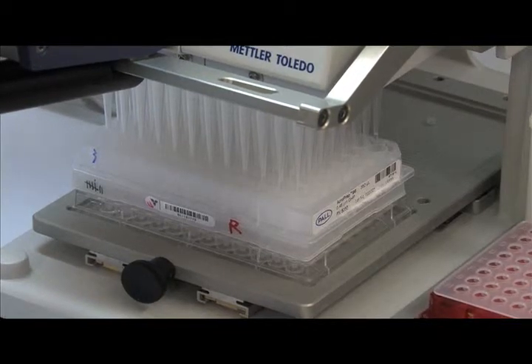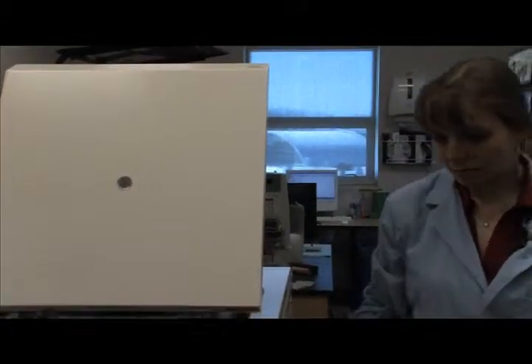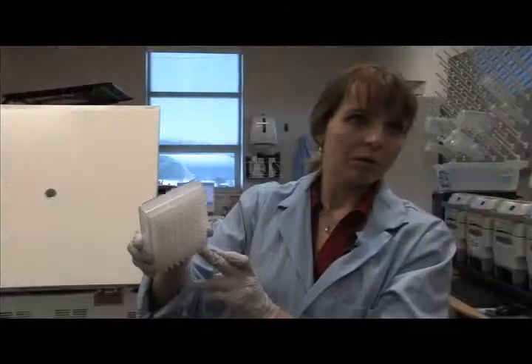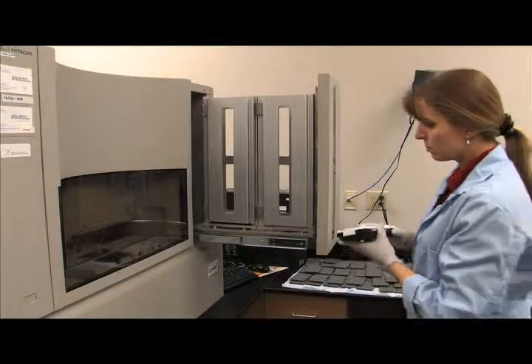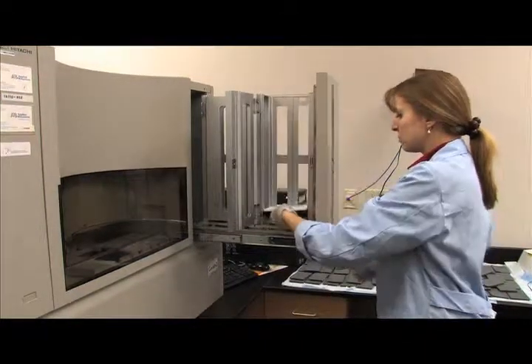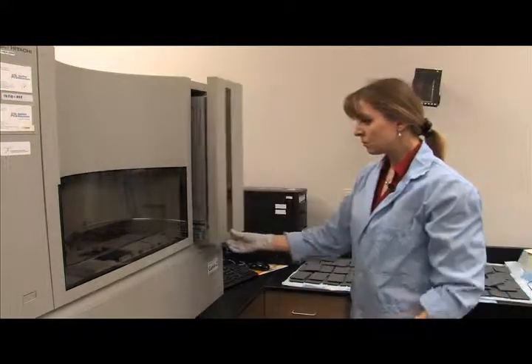No blowout is required. Plates are spun at 750 G's for three minutes. Clean sample is collected into a plate containing 25 microliters of diluted EDTA. This is one of the final stages of acquisition DNA barcode. The plate is sealed with SEPTA and assembled into a sequence assembly plate. The plate is then loaded into the sequencer. The sequencing sample plate is then transferred to the sequencer for further analysis of DNA barcode. The entire process is entered into the laboratory information system for proper sample tracking.